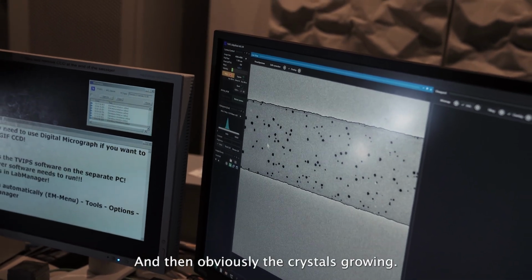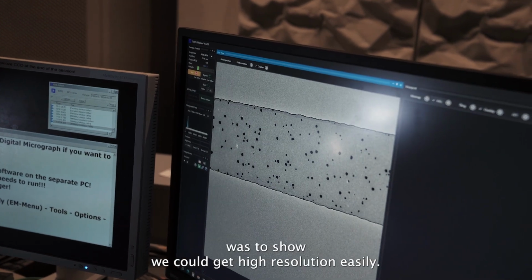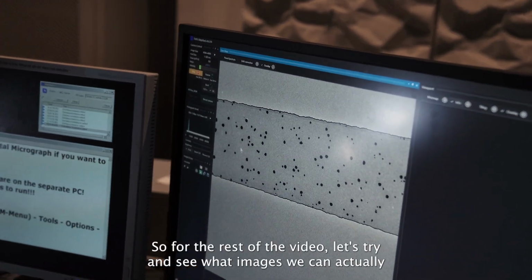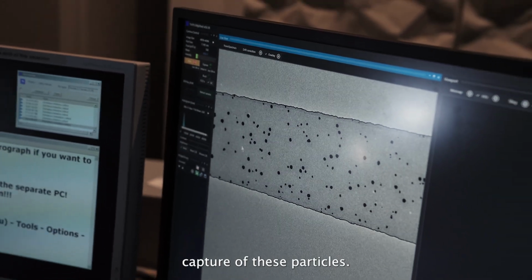obviously the crystals growing. So the purpose of this video was to show we could get high resolution easily. So for the rest of the video, let's try and see what images we can actually capture of these particles.